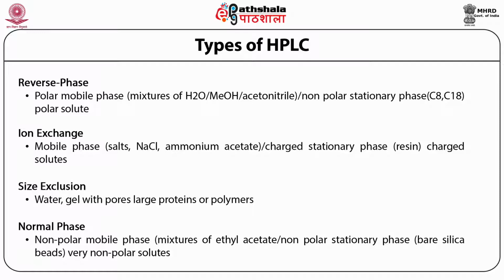Then came reverse phase. What we have done is convert the stationary phase to hydrophobic, upon which hydrophilic solvents are used. The hydrophilic solvents are water-based solvents, miscible with water in any ratio. Water, methanol and acetonitrile are used in most applications of reverse phase chromatography.